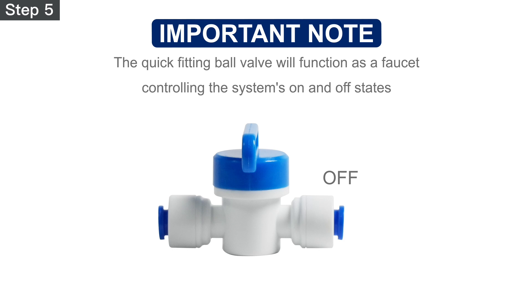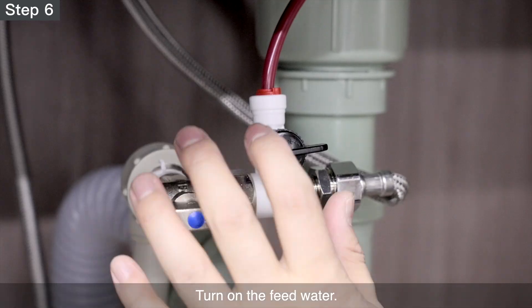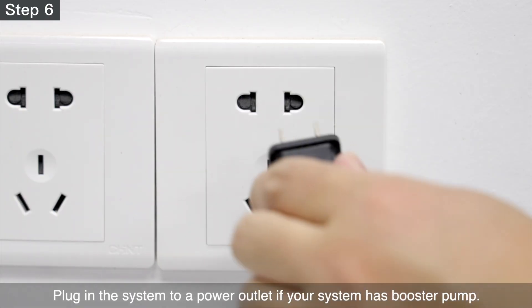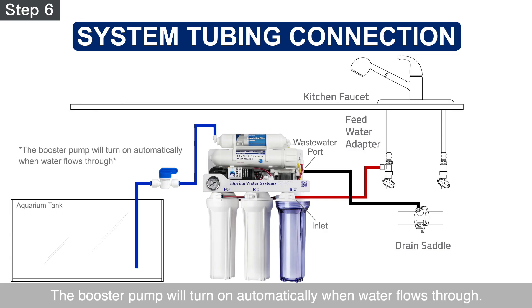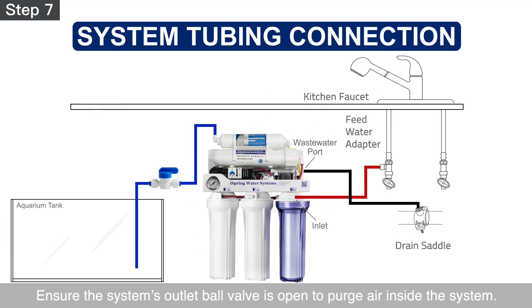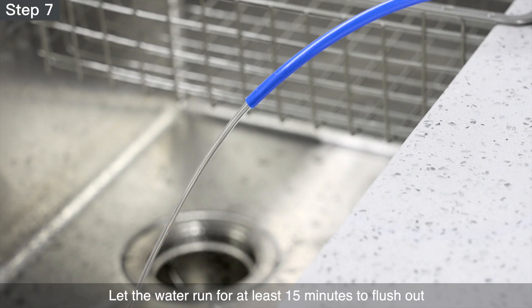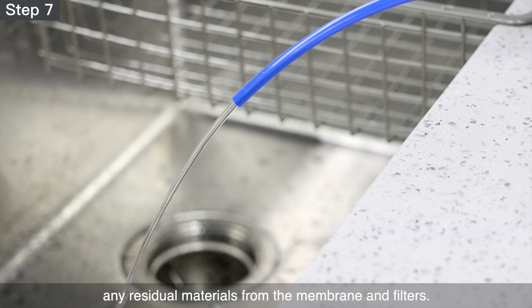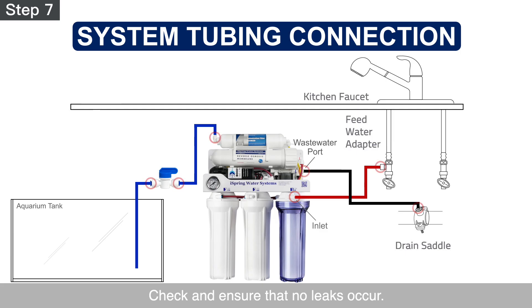Please note that the quick-fitting ball valve will function as a faucet controlling the system's on and off states. Step 6 – Turn on the feed water. Plug in the system to a power outlet if your system has a booster pump — the booster pump will turn on automatically when water flows through. Step 7 – Ensure the system's outlet ball valve is open to purge air inside the system. The purified water will start to purge within a few minutes. Let the water run for at least 15 minutes to flush out any residual materials from the membrane and filters. Check and ensure that no leaks occur. Once the flushing is completed, the system is ready for use.